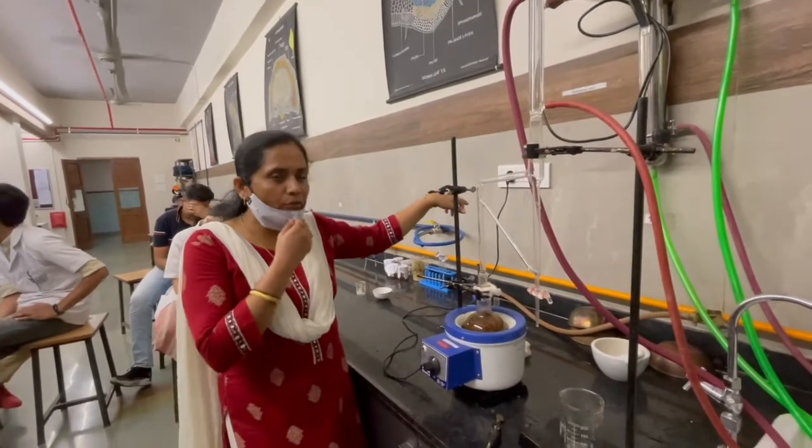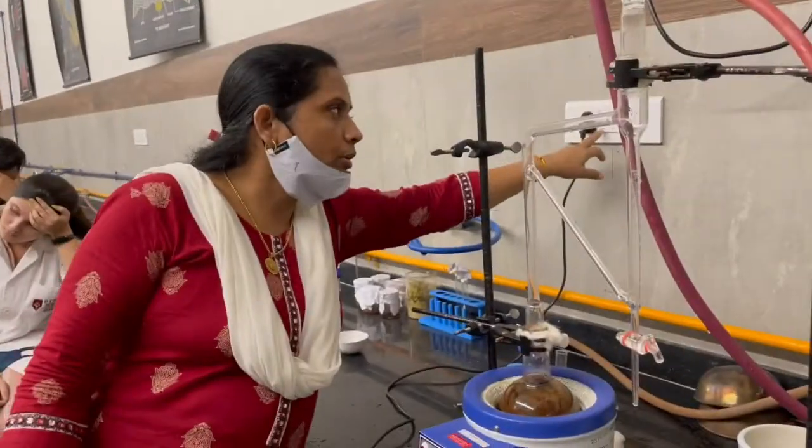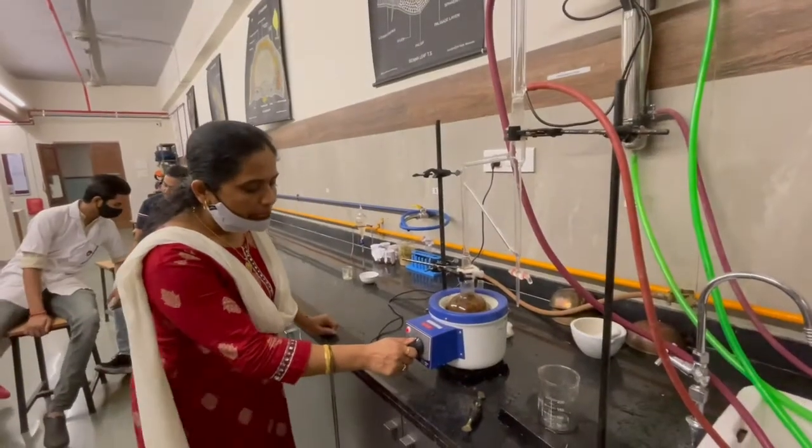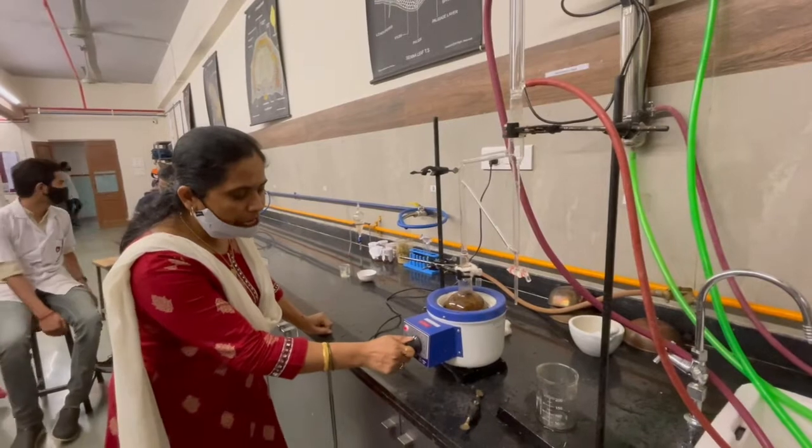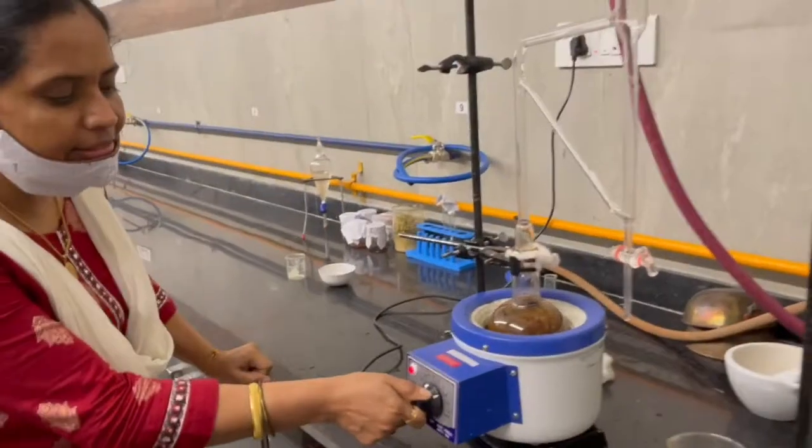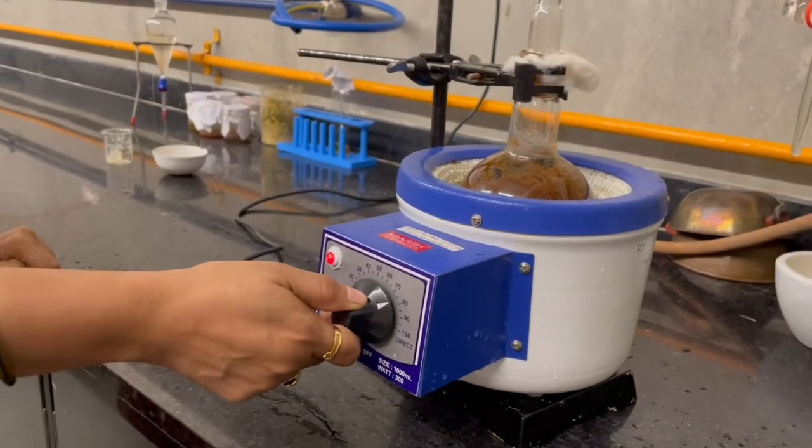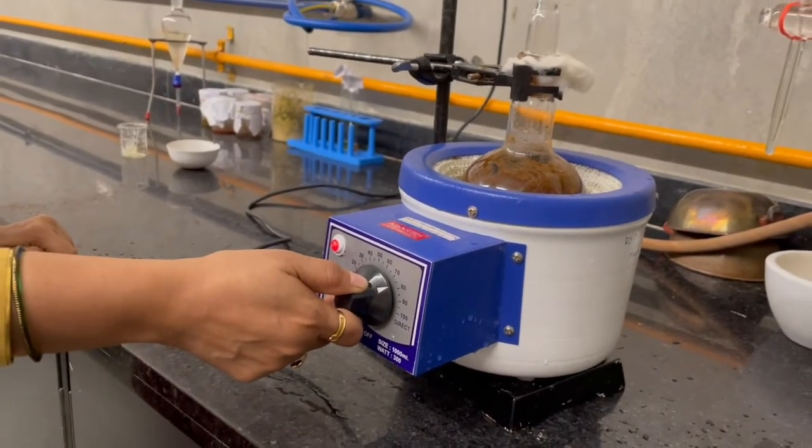Switch on the electrical supply, then adjust temperature around 80 to 90 degrees Celsius. We know that boiling point of water is 100 degrees Celsius, so we need to adjust temperature in between 80 to 90 degrees Celsius.